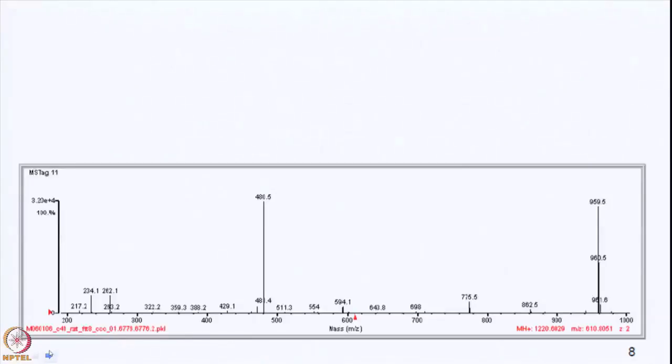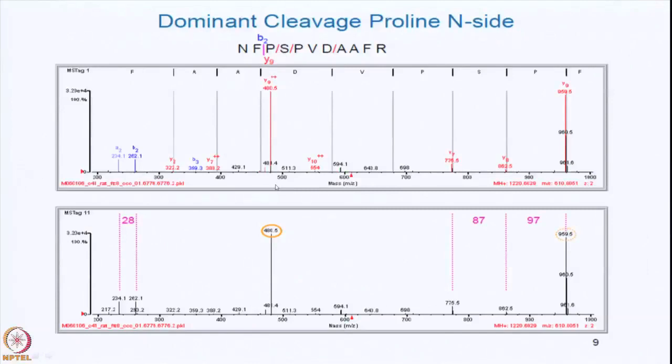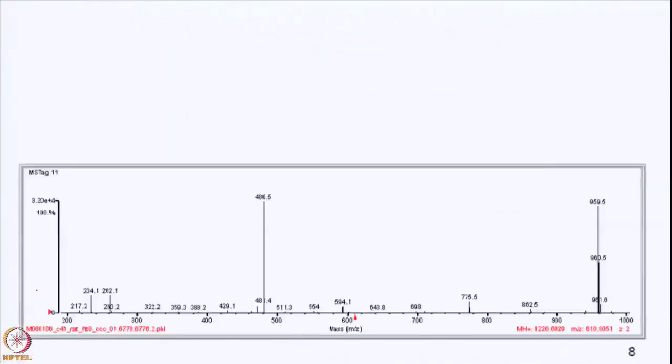So let's go to the next one. Okay. So this one is going to be easy because there's not very much to work with. All right. So you take a look at the spectrum. There is not a lot of symmetry. But if you look at this, it is doubly charged. Okay. 2 times 480 would give you 960. Right? There's 2 charges on this. There's only 1 charge on this. All right, what else have we got? Okay, this is 1220. Is there any symmetry here?